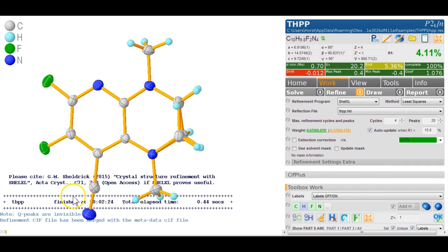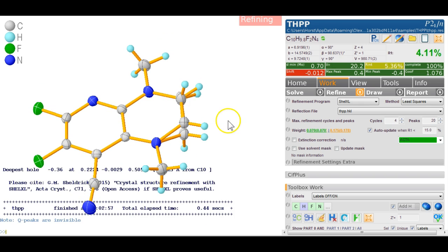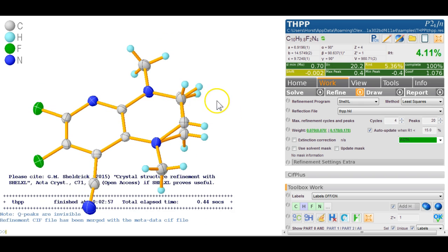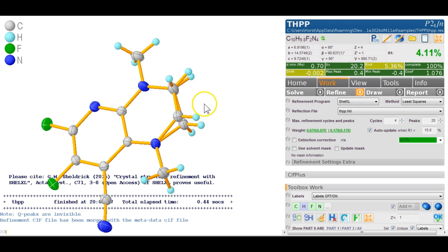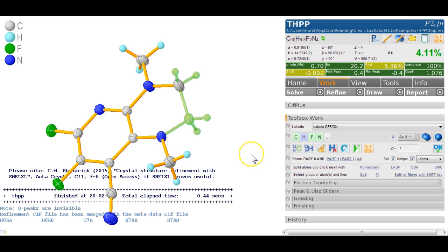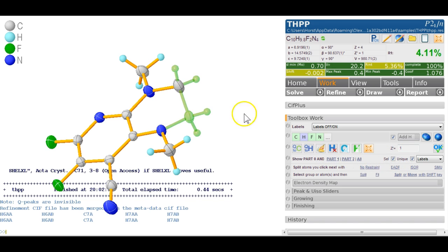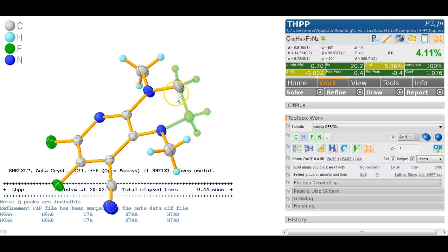Now in case you've been wondering what's going on here, this looks a bit funny this disorder and there are three hydrogens on there. Let's examine this in a little bit of detail. I click on this so we've got part zero and part one. Click on part one, we see the major part. Now click on this again so this is checked here so that means it's going to be selected. See these hydrogens are actually in part one because this is an sp3 carbon, those two hydrogens on so that belongs to that part.